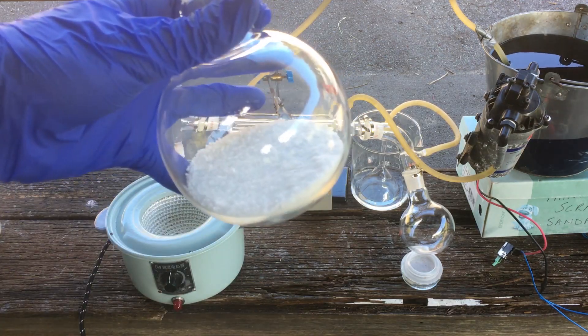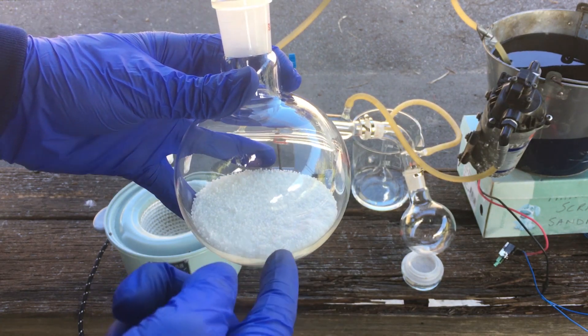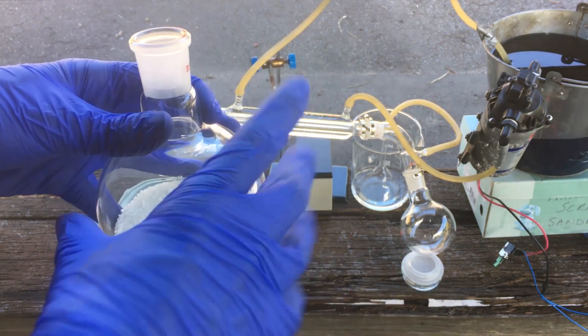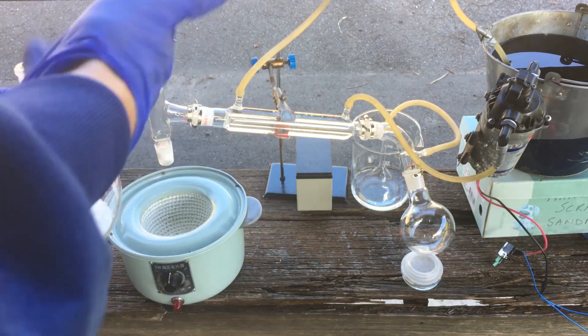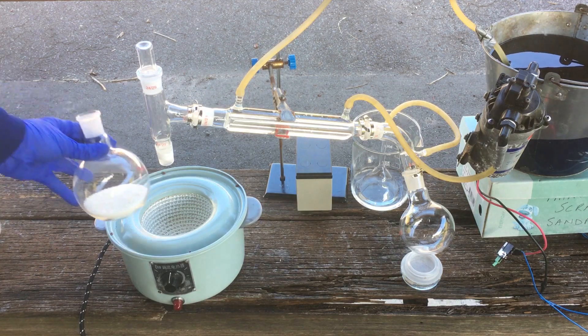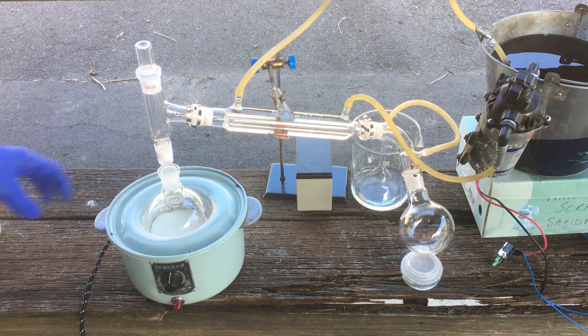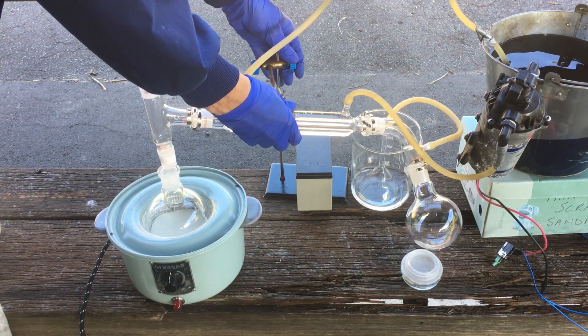The idea is to just heat this up with our heating mantle. The mixture will melt because the sodium bisulfate is of the hydrated form, and then heating it up past the boiling point of nitric acid will cause the nitric acid to distill off. You can see we have this distillation apparatus set up already, so without further ado we'll get this started, and then I'll talk you through the setup.